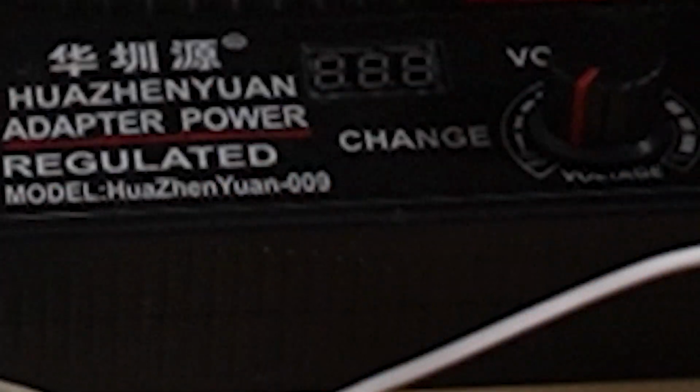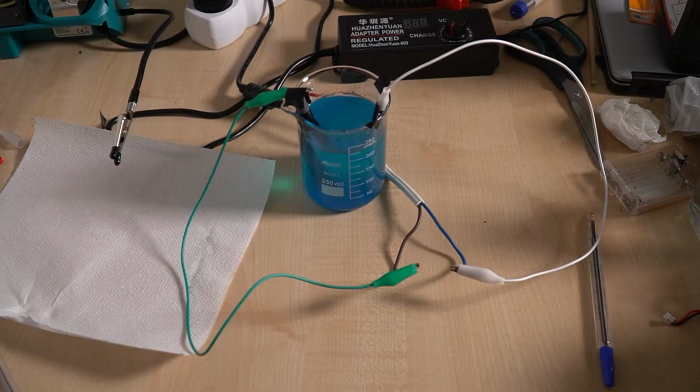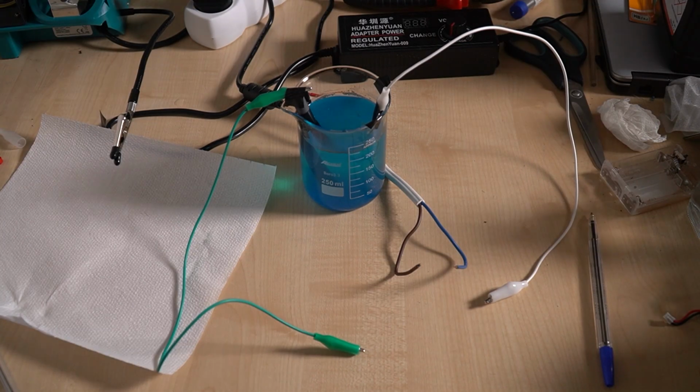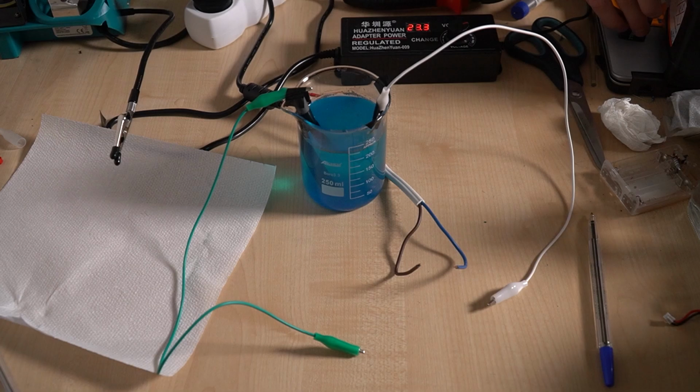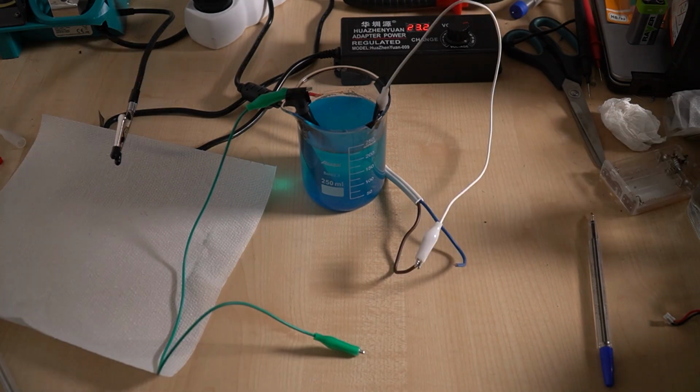If not for the fact that yours truly bought a voltage supply instead of a current supply, because I kind of ran out of funds for the video, but that doesn't matter. The point is, we could figure it out hypothetically. And also we can figure it out based on the color. Anyhow, here's some fun footage.